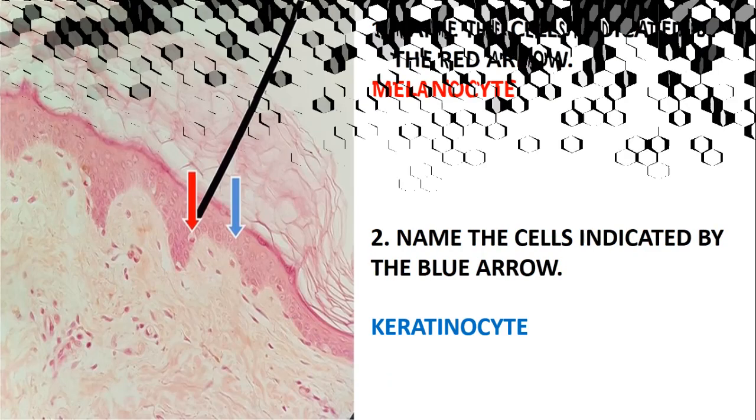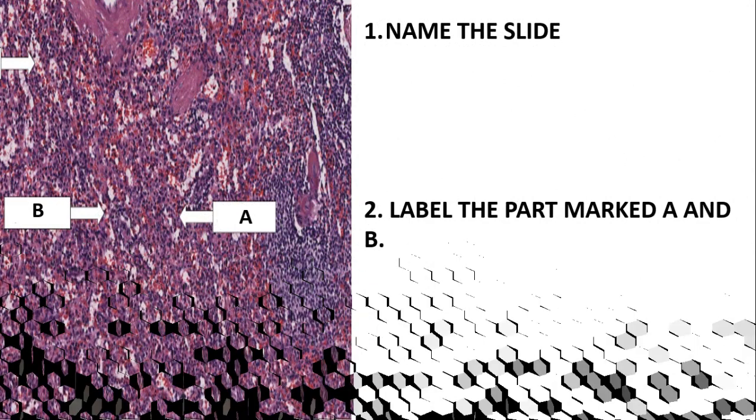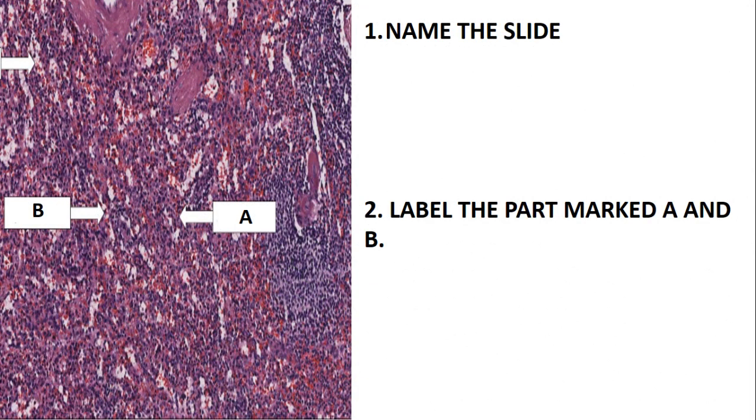Okay, let's quickly look at the next slide. Name the slide. If you look at this slide, it is simply the spleen.